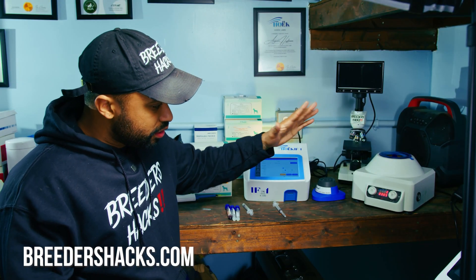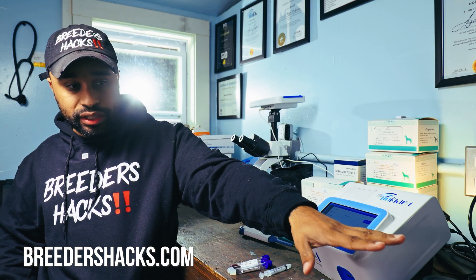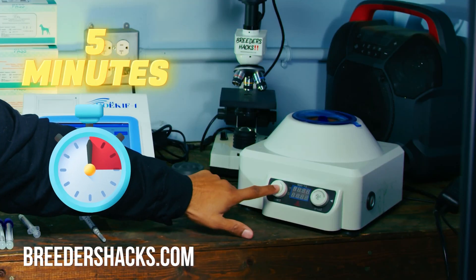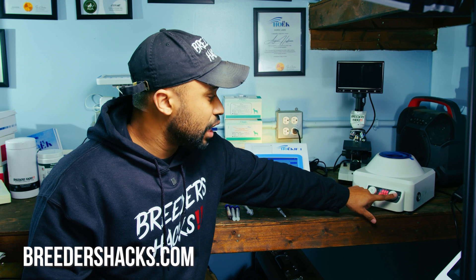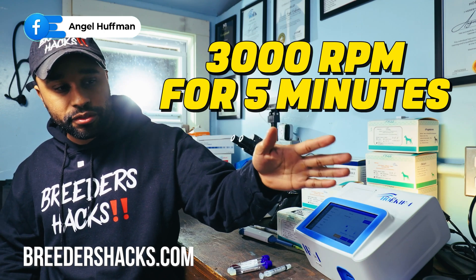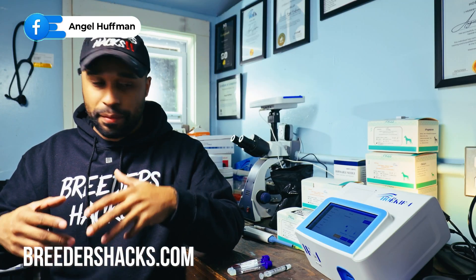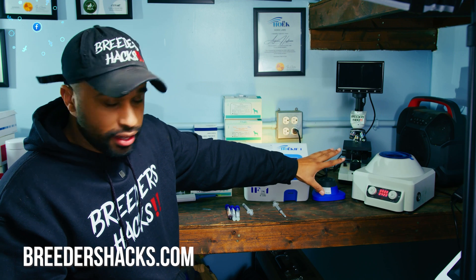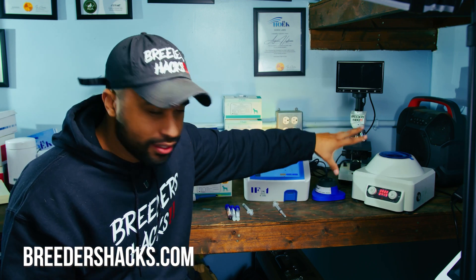The 10 minutes just ran up. So I'm going to go ahead and set it for another five minutes to spin. I usually just turn it up to the highest the machine can go — 3000 RPMs for five minutes. This is a little bit longer than I would do before; before I would just put it in the centrifuge and spin it and get my sample. But this way has allowed me to not have any more issues and get the most accurate results and perfect samples every time. We'll let this run for another five minutes and then show you guys the end product.